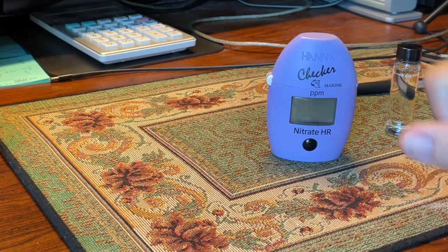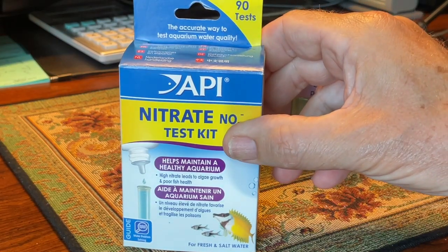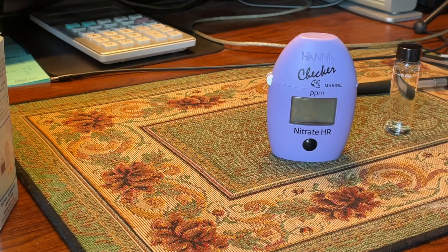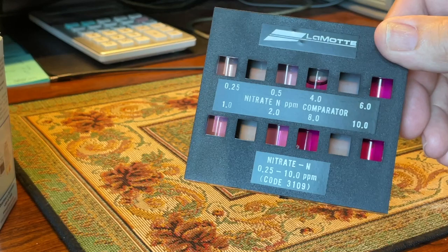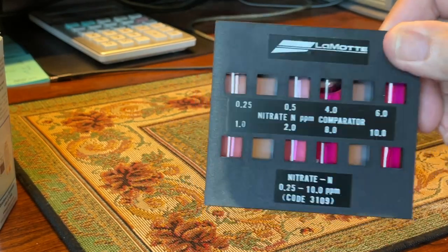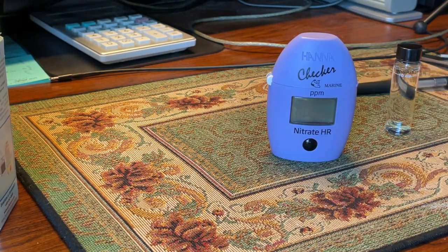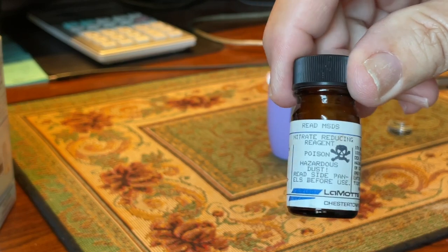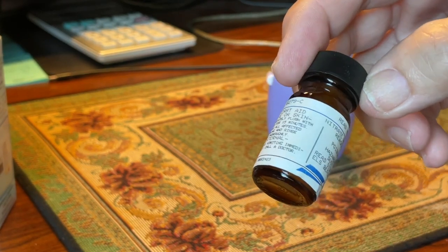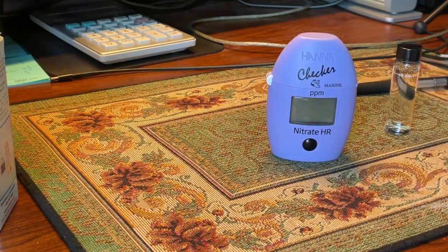I tested it against an API with a standard solution and also against a LaMotte. The LaMotte test kit is a pretty elaborate kit that goes down to 0.25 to 10 parts per million of nitrates — it's a very expensive, professional-grade kit. It comes with different chemicals, some of which have skull and crossbones warnings, so it's not something you'd want around children.